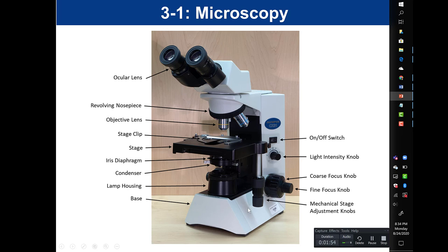We have the base of the microscope and the mechanical stage adjustment knobs. One set of knobs moves the stage left and right, and one set moves it front and back. We also have our focus knobs: the large coarse focus knob moves the stage up and down relatively quickly, whereas the fine focus moves the stage up and down very slowly. We use the fine focus to fine-tune the image once we find it with the coarse focus.